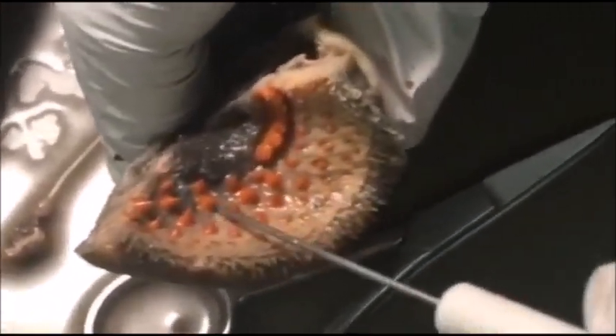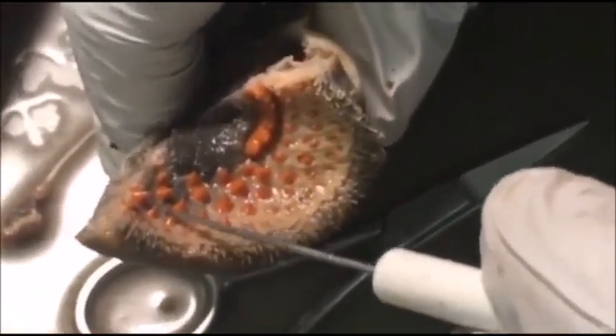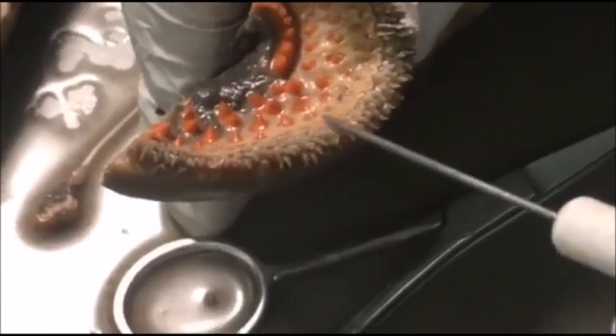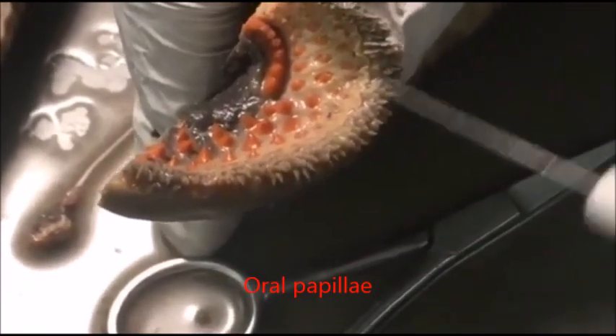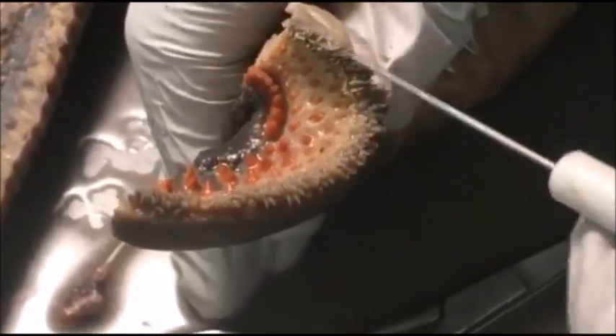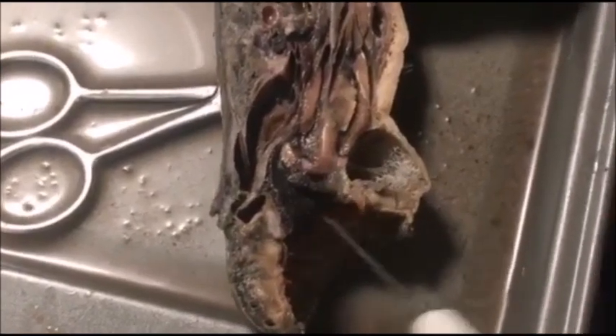If you look at his mouth, you can see these teeth that are used to penetrate the prey's skin to get to the blood. And then there's what's called the oral papillae, which are basically sensory organs used to feel things out.